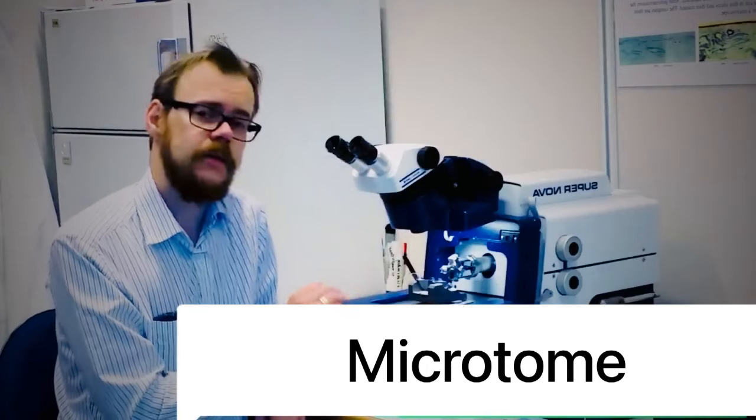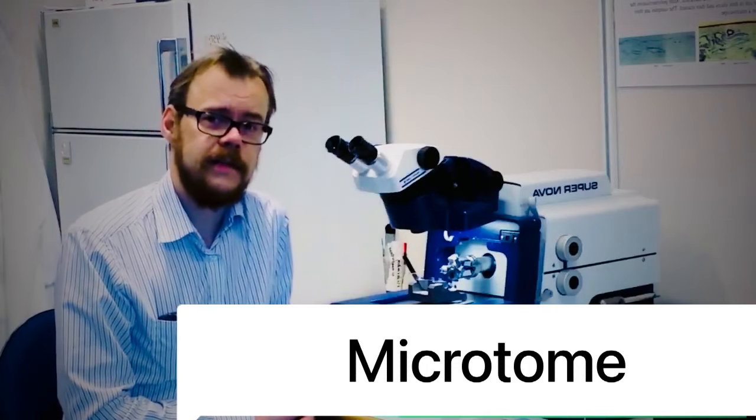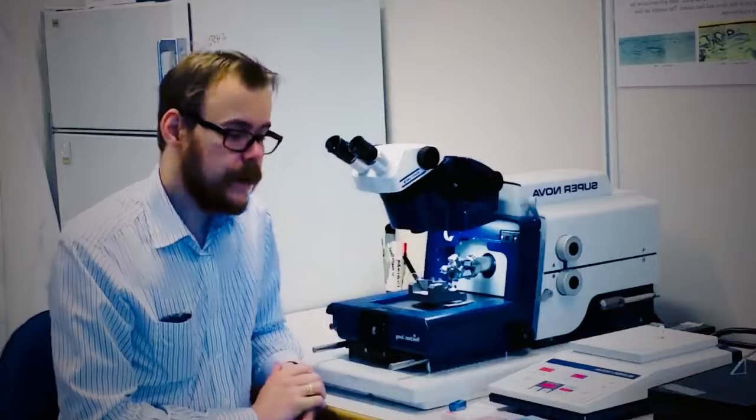Microtome. A microtome is a cutting tool used to produce extremely thin slices of material.